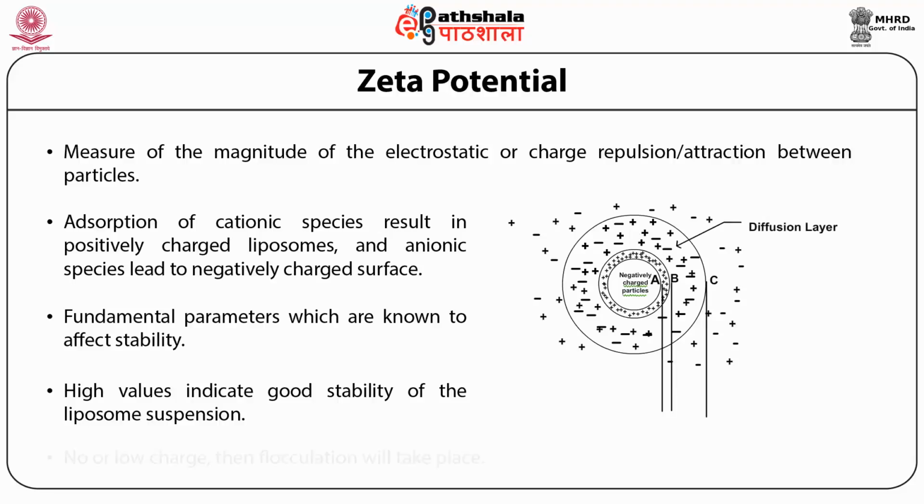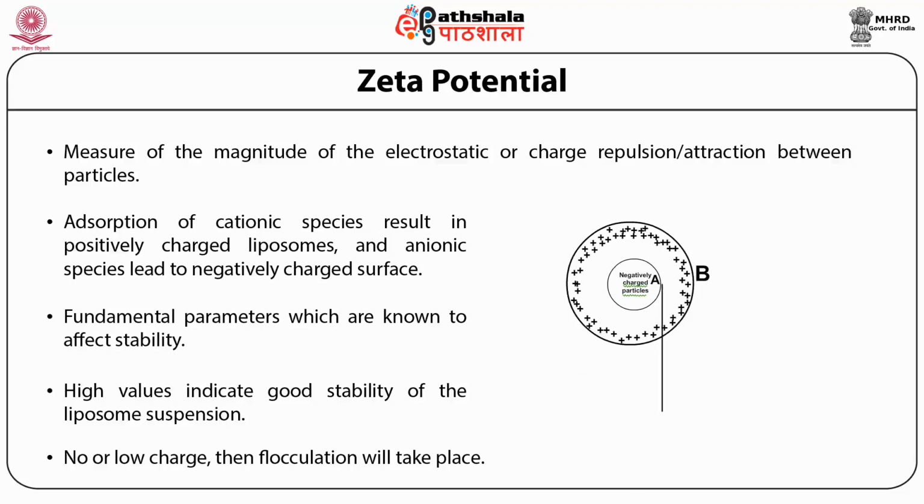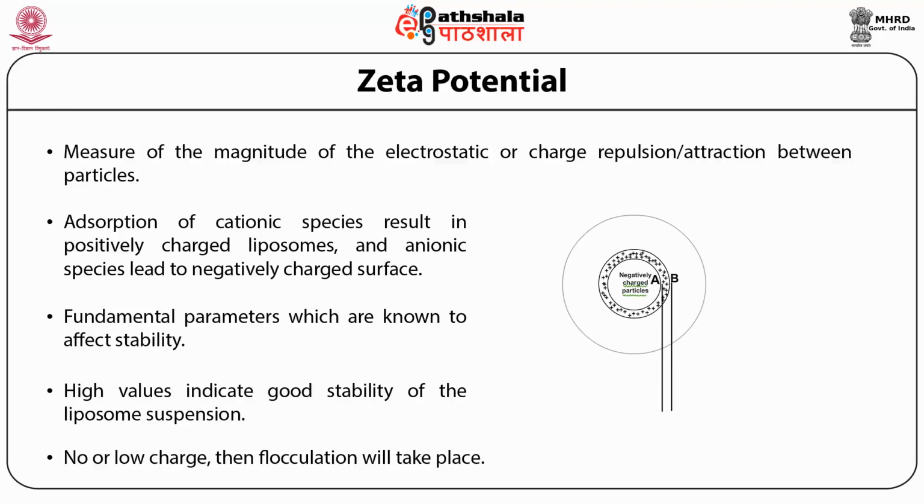Conversely, if there is no or low charge, then flocculation will take place. Zeta potential of liposomes is measured by using a laser which provides a light source illuminating the liposomes present within the sample cell.